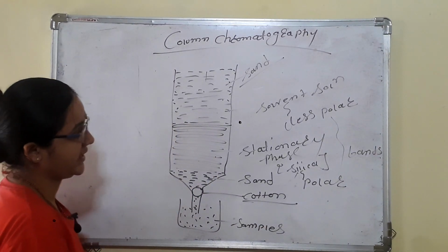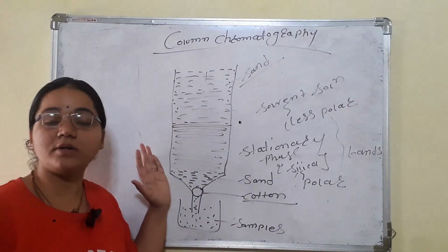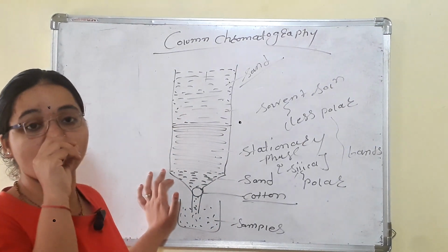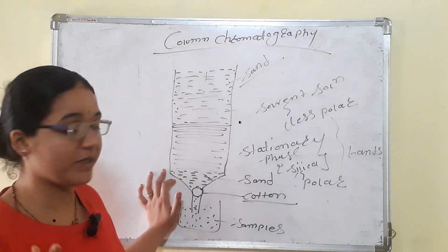Okay, that is a very important technique mostly performed in the lab, to separate the samples we want from the mixture components. Okay, we mostly use this popular technique, column chromatography.